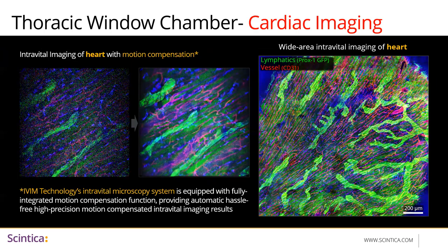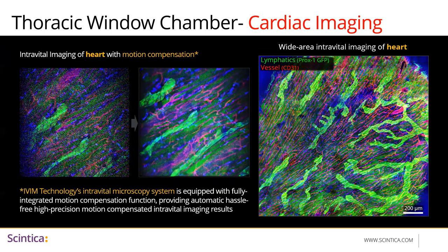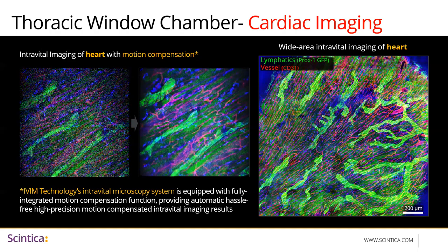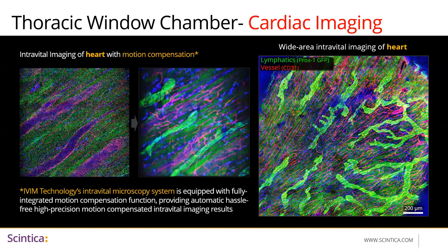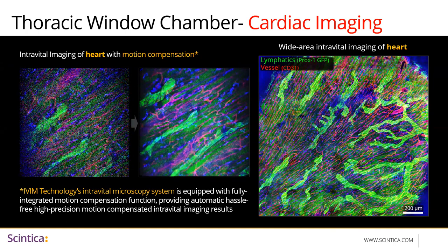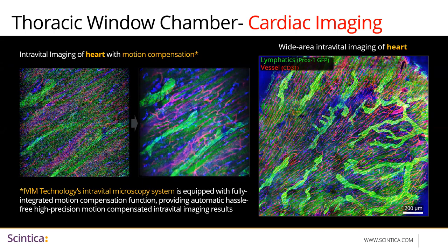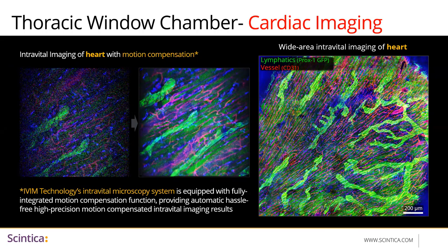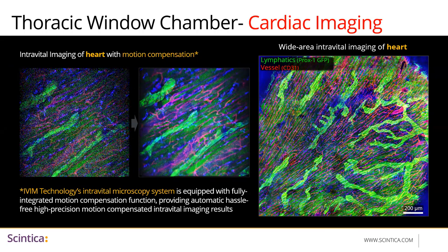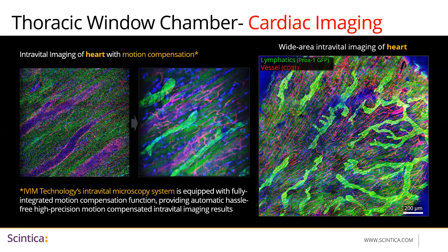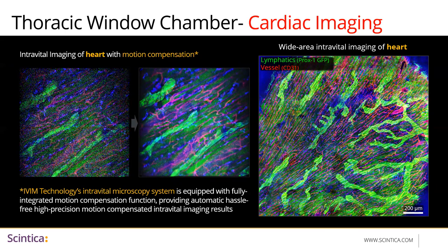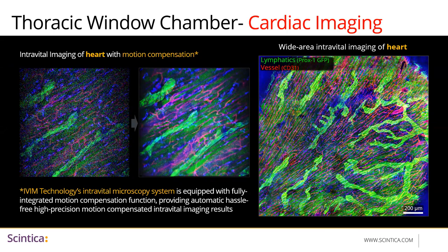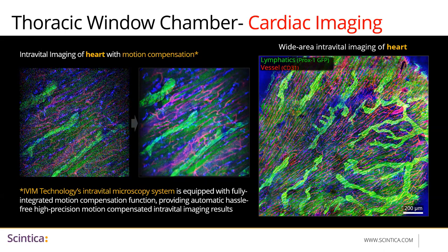This is imaging of cardiac tissue — another model that can use the thoracic window chamber. You can see how dynamic this tissue is while moving. This is the live scanning showing the beating heart, and with the motion compensation function we get a clear non-blurred image of this tissue. You will see lymphatic vessels labeled with GFP, blood vessels labeled in red, and the difference in sizes clearly shows the capillaries versus lymphatic vessels in the heart.